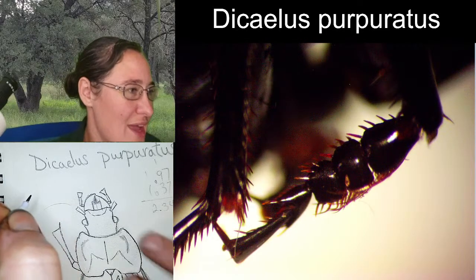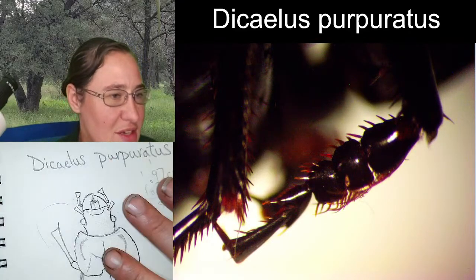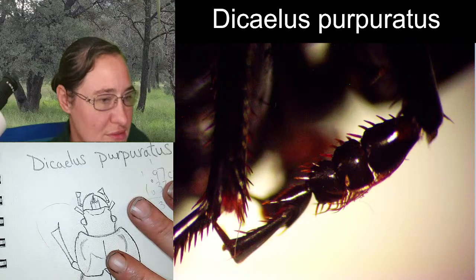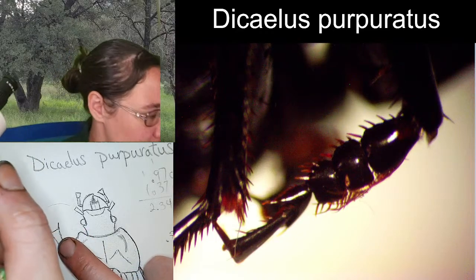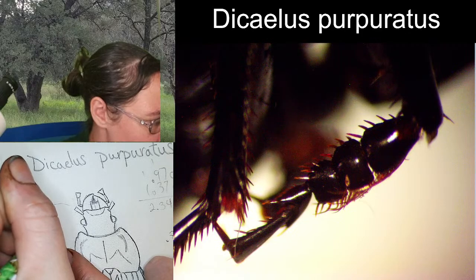That's okay. So there are five tarsal segments on this leg, and there are a good number of spines here, too. So let's see. We are kind of narrow, boxing out. We're going to go one.